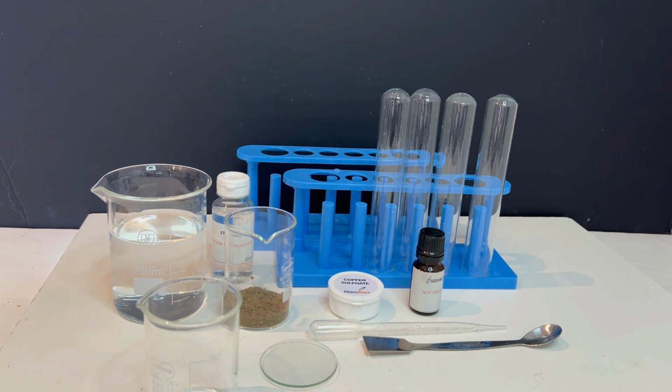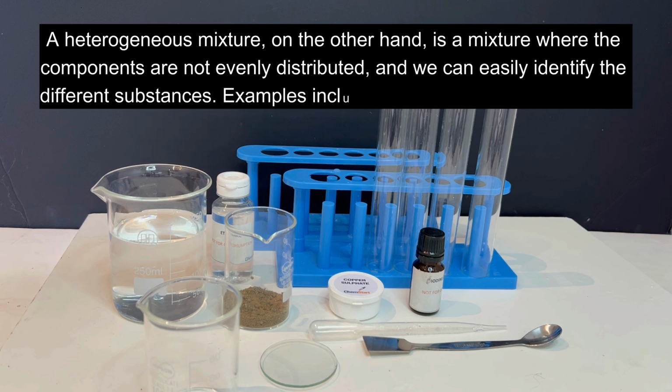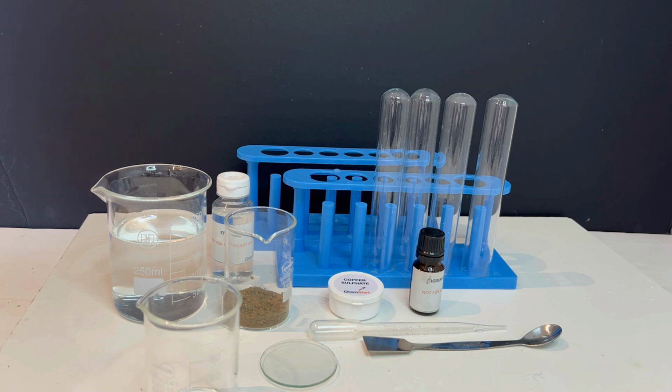What about a heterogeneous mixture? Now, a heterogeneous mixture, on the other hand, is a mixture where the components are not evenly distributed, and we can easily identify the different substances. Examples include sand in water and oil in water.